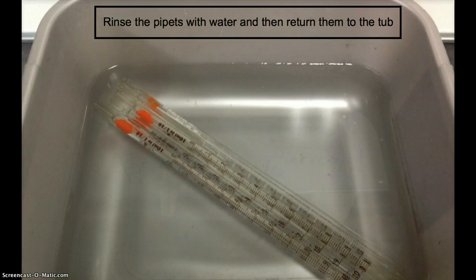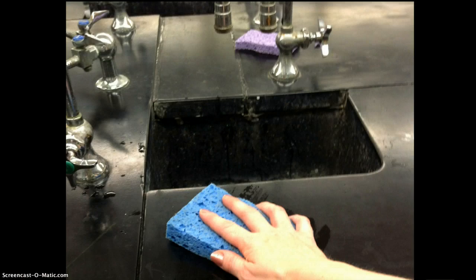When you are finished with this, rinse the pipettes with water and then return them to the tub where you got them at the beginning of the experiment. Make sure that you wipe down the lab table and rinse out the beakers that you used so that when you put them back in your lab drawer, they won't be sticky for the next time that you use them. Be sure to follow all post-lab procedures, including graphing and answering post-lab questions that your teacher indicates.